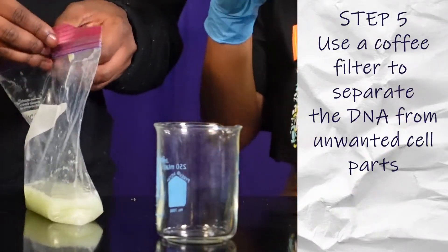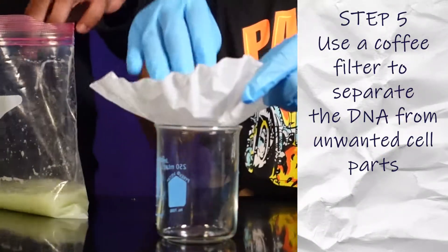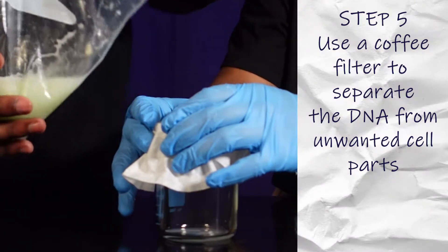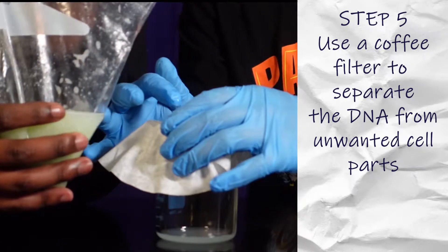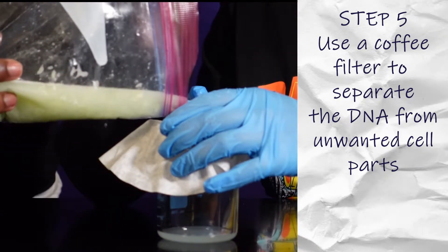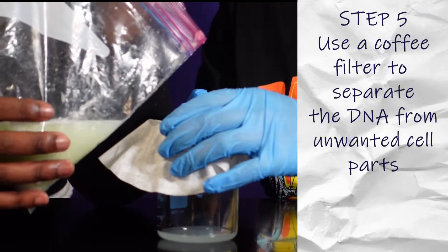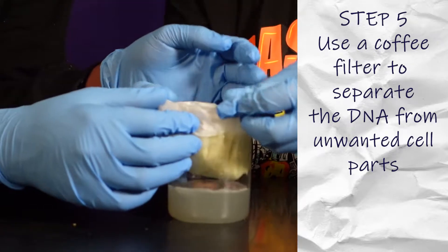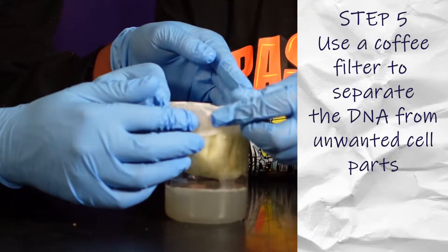We are going to use a coffee filter to separate the DNA from the rest of the cell. In the beaker is our DNA, and in the filter there are other parts of the cell that we don't need.